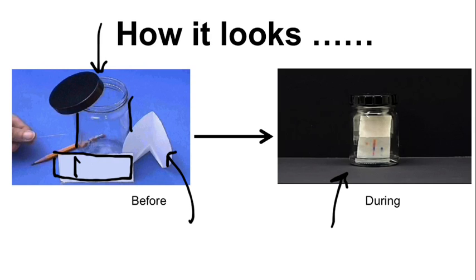as I draw through our structure here, is the solvent front. So as our solvent is rising up through it, we can see our TLC plate get wet. Okay? And we've got that barrier between the dry and the wet side of the TLC plate. You can see that only while it's running, because more solvent is replacing it and keeping it wet.